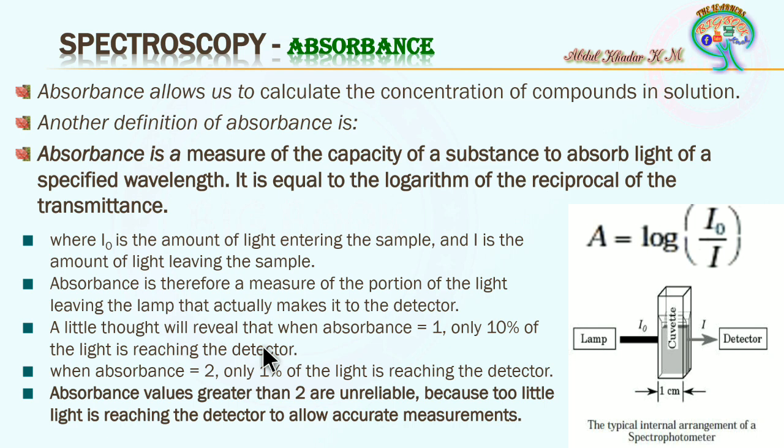We measure between 0 to 1 or 0 to 2 depending upon the opacity of that particular compound. Opacity, in the sense that the compound itself is an indicator or an indicator has been used in the compound. Depending upon that particular compound or indicator, the thickness or darkness of its dye or color, the absorbance is going to increase within the compound as the light passes through it.